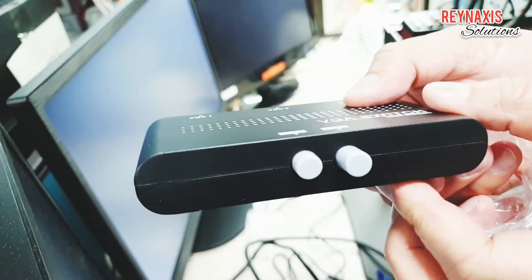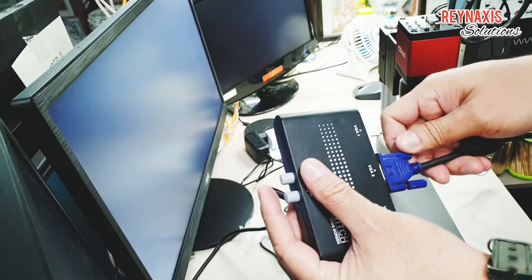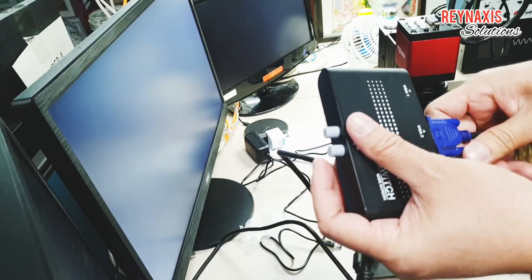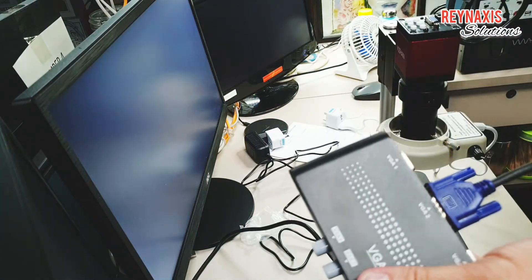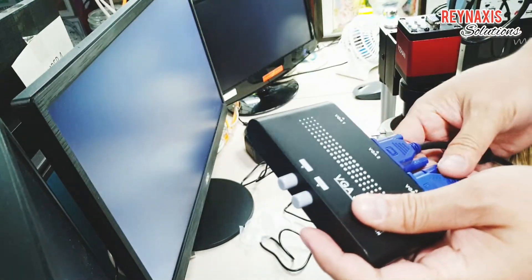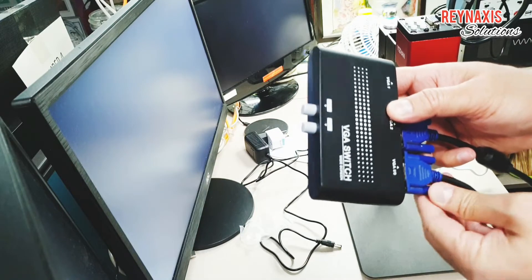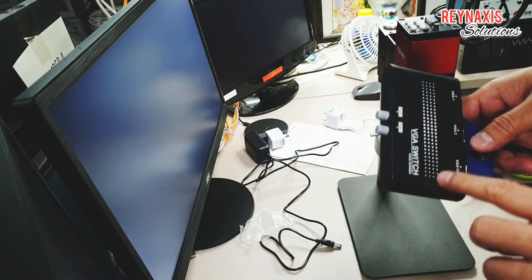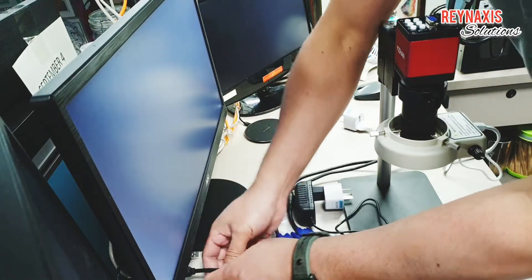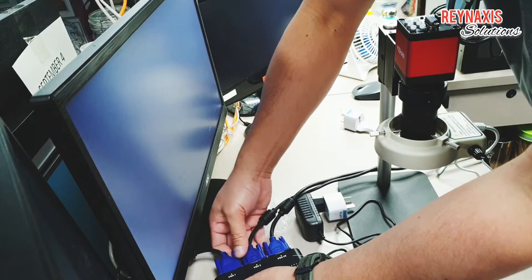I also bought this VGA switch, which will be used for switching between my monitor and the camera. The monitor is always connected to my computer, but if I want to use the monitor for the microscope camera, I'll just press the switch on the VGA switcher. This switch needs three VGA cables: one from the camera, one from the computer, and one connected to the monitor for output. If I press button one it connects the PC to the monitor; if I press two it connects the microscope to the monitor.